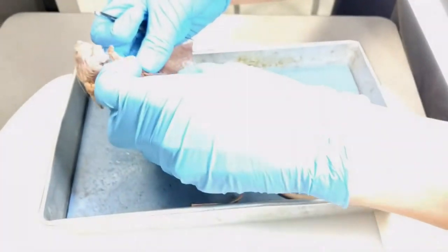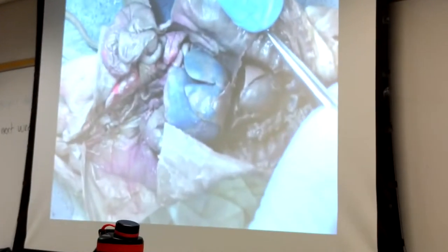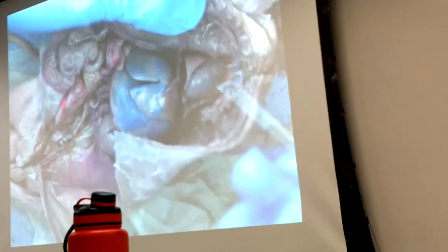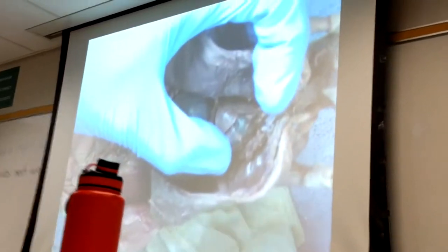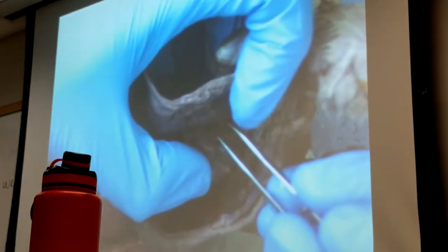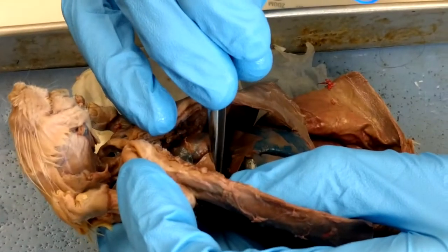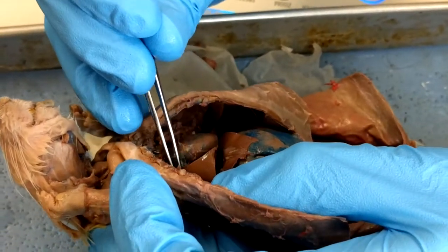Starting in the thoracic area for the lobes of the lungs. There are several lobes on the right side — remember, you're talking about the rat's right and left. So here you have three lobes. The top one is the cranial lobe of the right lung, then the middle lobe of the right lung, and then the caudal lobe of the right lung. So there are three lobes on this side.